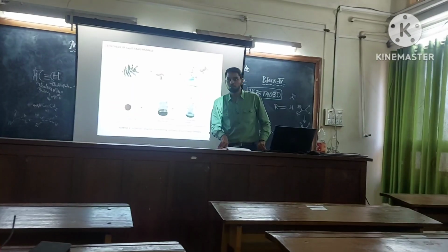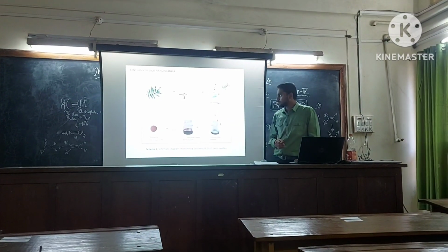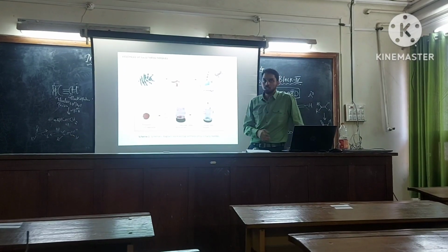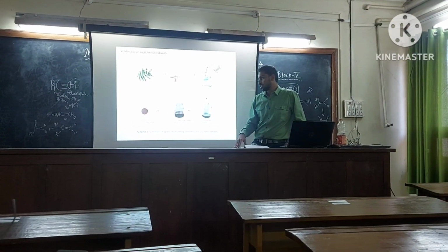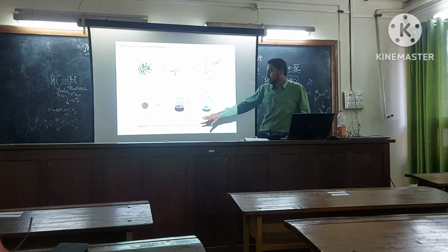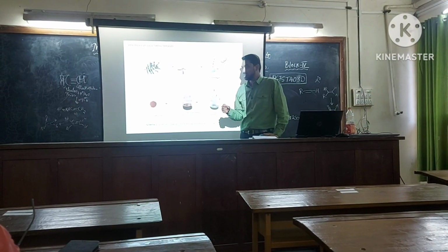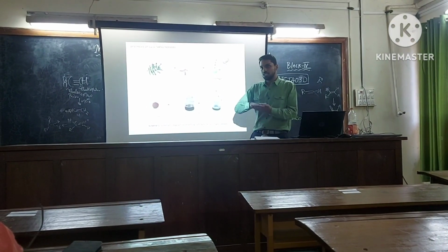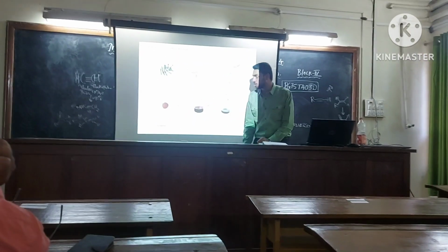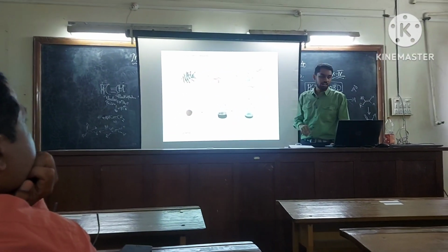Initially chemicals fragment, so we need to maintain the pH; that is why we added NaOH. We stirred it for 2 hours, and then we obtained a greenish blue color solution. We kept it overnight, like 2 days. Then we could see a color change from greenish blue to brick red, the copper oxide nanoneedles, and we allowed it to settle. Then we centrifuged, took the sediment in a watch glass, and dried it in a hot oven. Later we obtained powdered copper oxide nanoneedles. This is the scheme by which we have synthesized copper oxide nanoneedles.